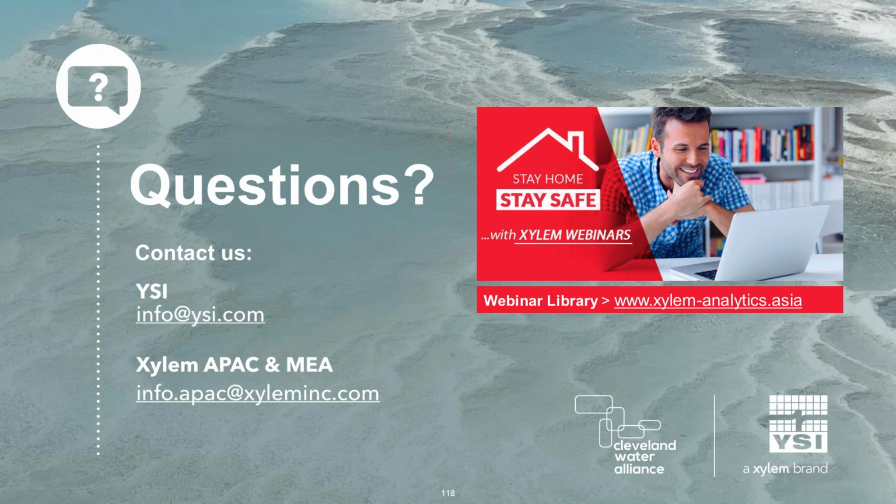There was a large portion of the audience that seemed to be very interested in total dissolved solids, or TDS, and so I highly encourage those folks to review the manual. It can be a little tricky, so if it still doesn't seem clear, contact your tech support for further assistance. But a TDS coefficient should be determined in each sample that you would like to measure. And just to tie it back to the question, that's not required for salinity. The salinity value is automatically calculated by our sensors. You don't have to do any extra work to get meaningful data.